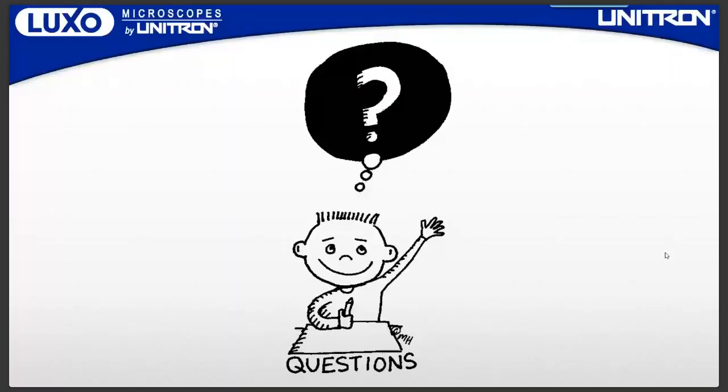Also, Kieran, what are the lighting options for the Omni? Yeah, so as I was saying at the introduction, the standard ring light comes with the system. That's a quadrant controllable fused LED ring light. We also have a UV ring light. It works on the same principle. It literally snaps in and out. There's no cabling, no fuss. We can actually make UV lights to order.